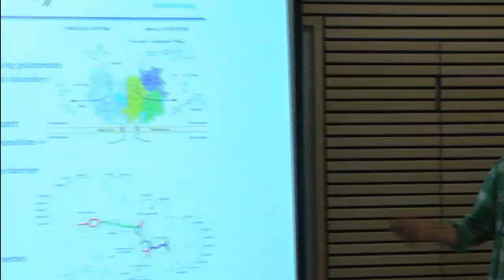Good afternoon everybody. I'm Jakub Táček from the Laboratory of Structural Biology at the Institute of Biotechnology in Prague. My project here is the comparison of sulfamides and phosphinates as bimetallic peptidase inhibitors of glutamate carboxypeptidase 2. Glutamate carboxypeptidase 2, GCP2, is a protein.